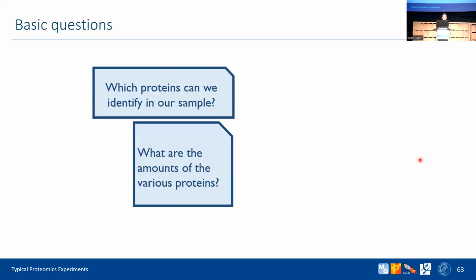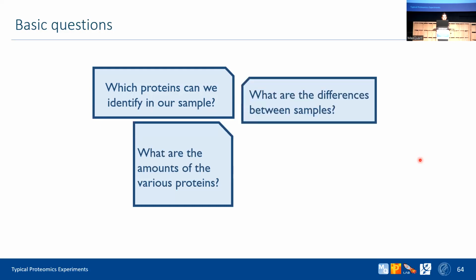But then I don't want only to know which proteins I have in my sample, I also want to quantify them. So that's another question. I want to know the amounts of the proteins in my sample, so the absolute value of these proteins.